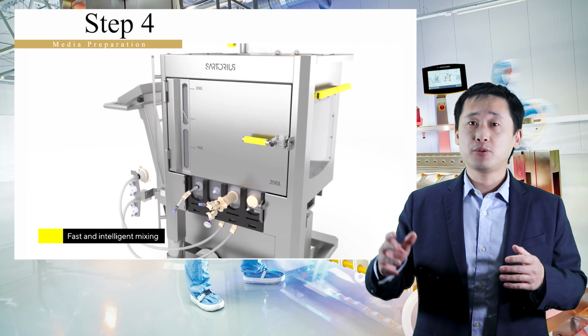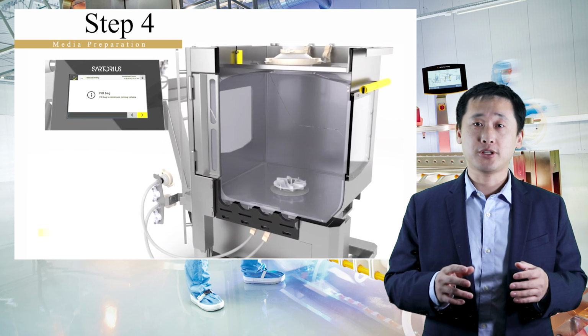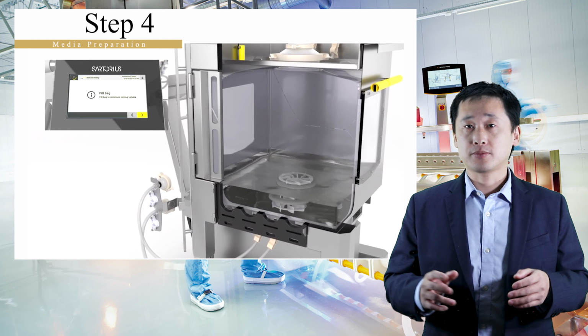Now, as we continue to explore cell expansion and scale-up, media preparation on this scale becomes more important, and that leads us to step 4.